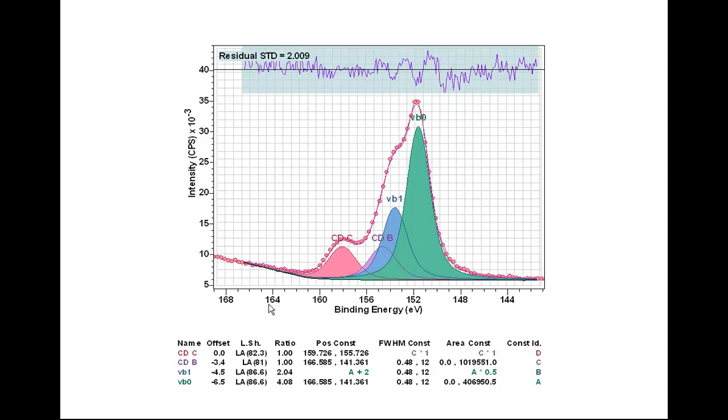These peaks were designed to be offset by increments of 0.5, and the ratio of these peaks should be 1, 1, 2, 4. So we introduce these parameter constraints between the full width half maximum and also the area between 2 peaks, and then another pair of constraints that relate another pair of these peaks, and with these constraints we end up with the expected return from fitting this peak model to data.